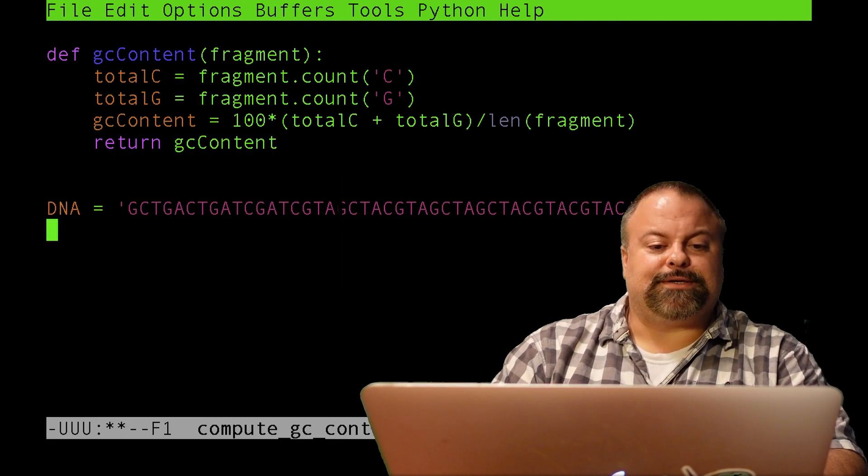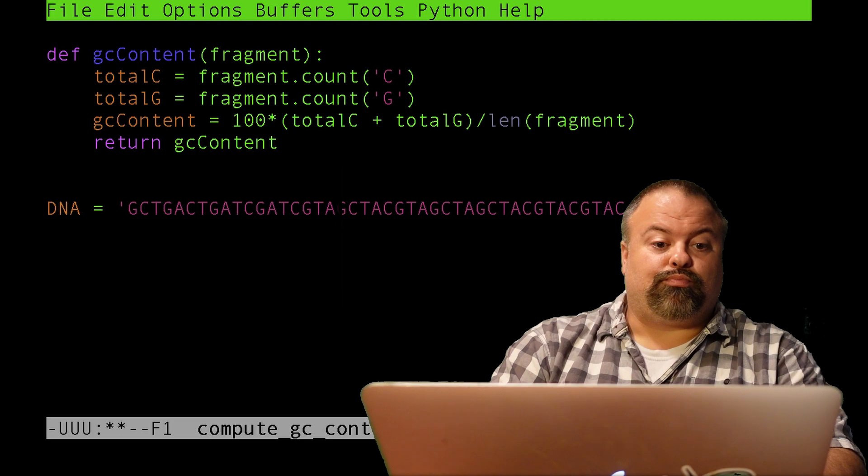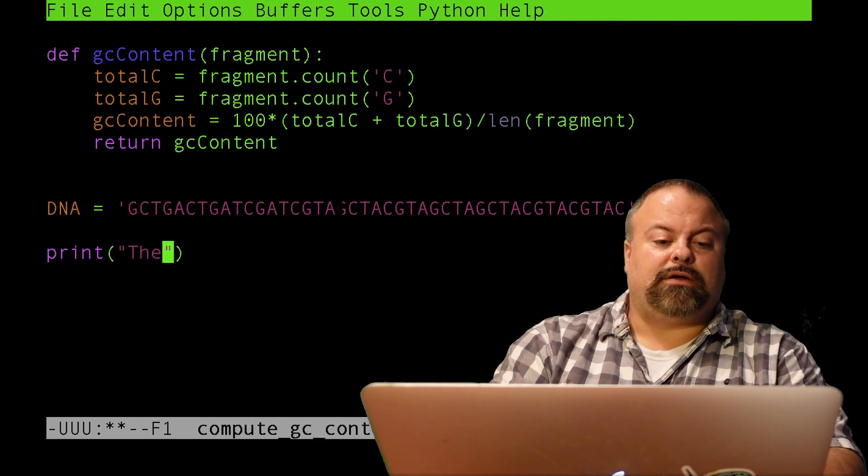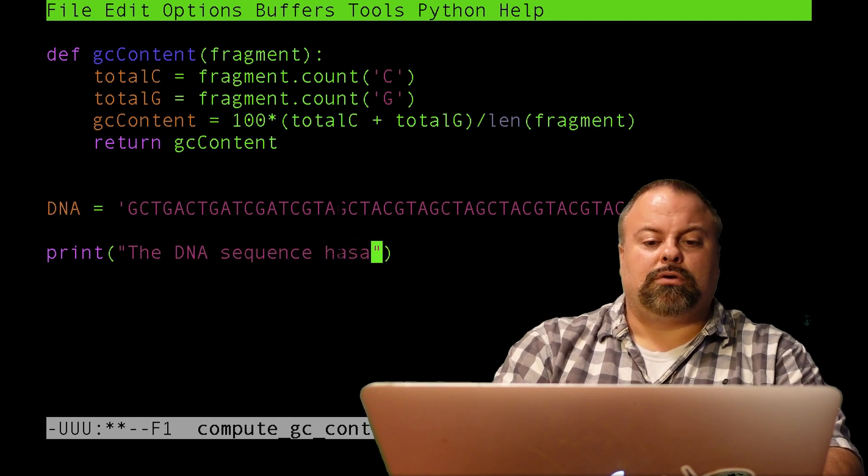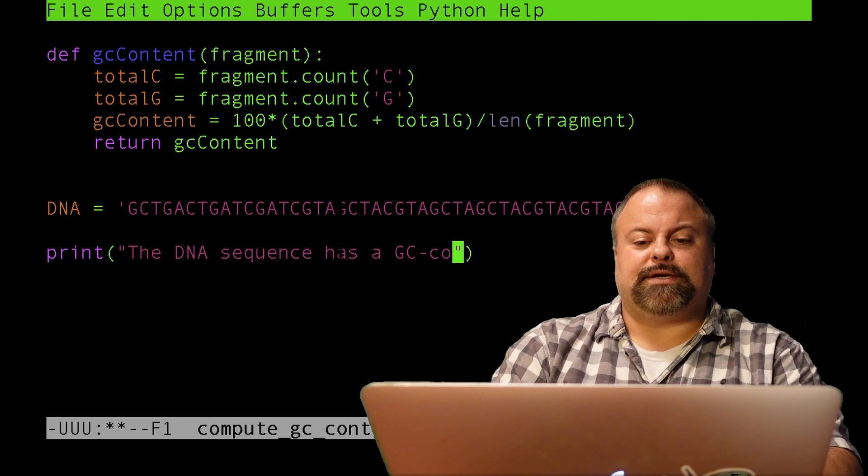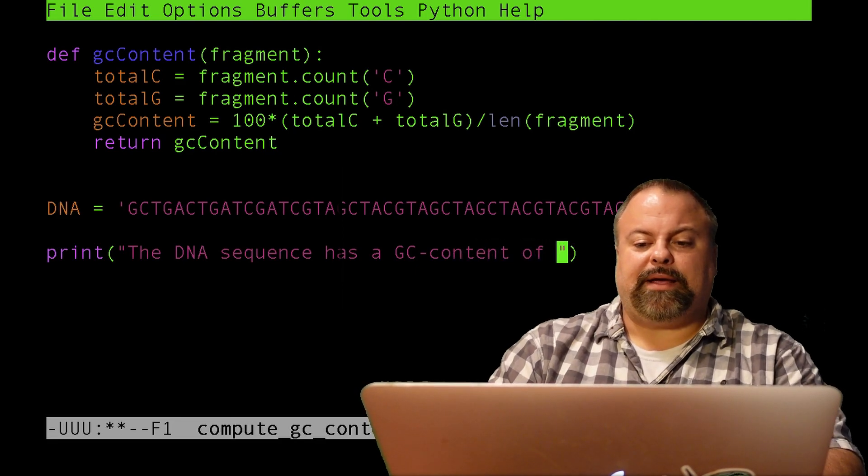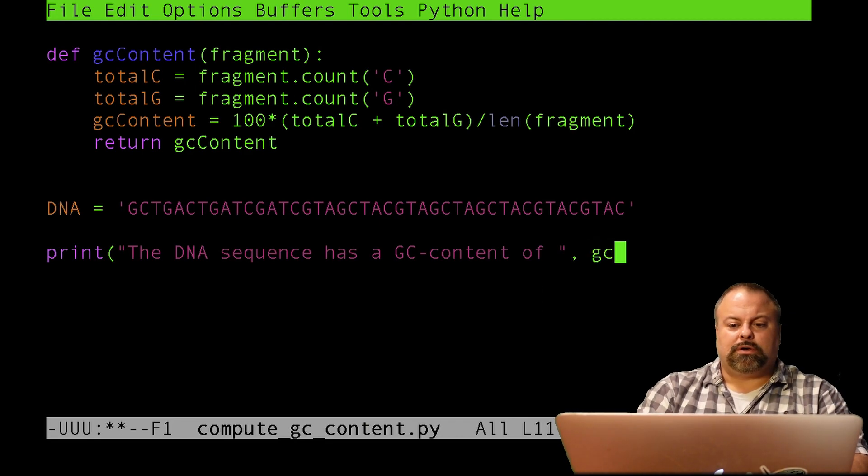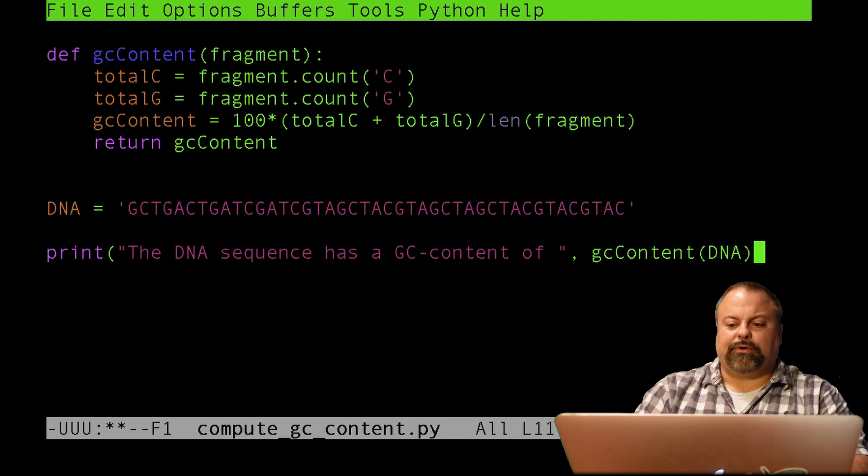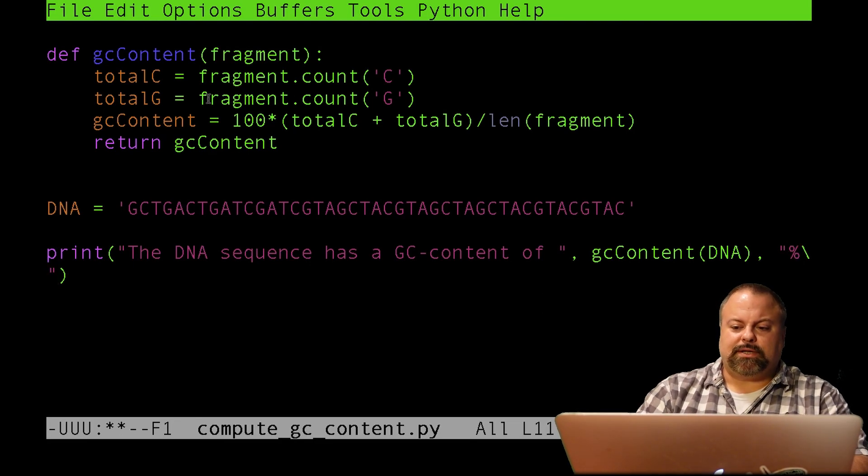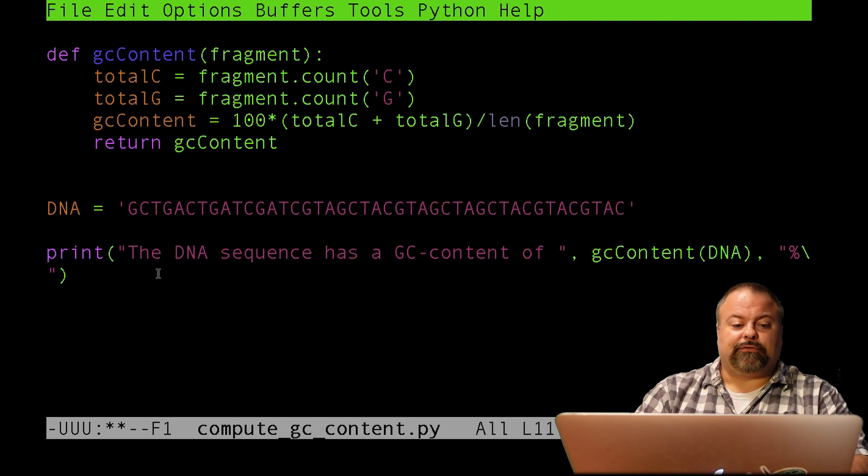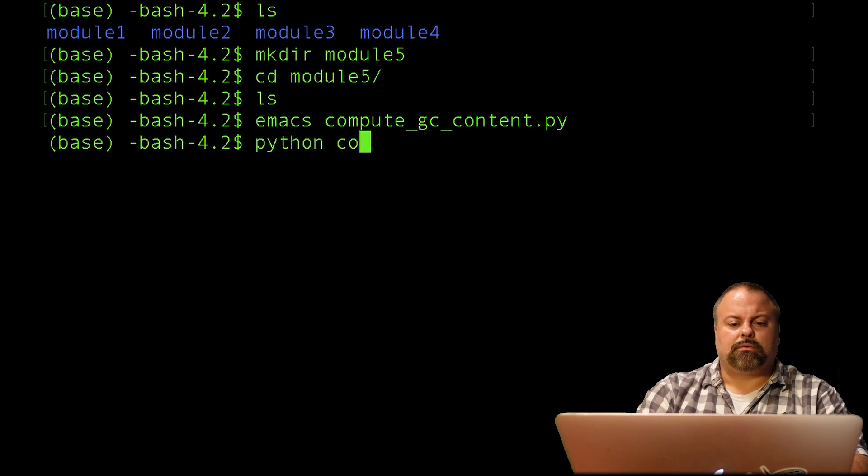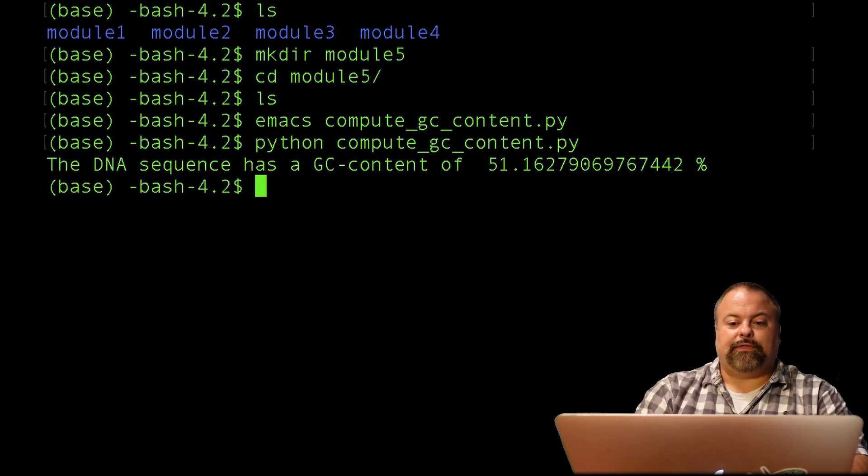So I could say, for example, I could say print in parentheses and say the DNA sequence has a GC content of space, and then maybe I'll put parentheses to define the GC content, and I can go ahead and type the subroutine's name directly into the print statement, put another comma, and put another set of quotes and put a percent sign so that the percent will be printed after that particular variable. So let's try that. Save, and I'm going to run. And there it is.